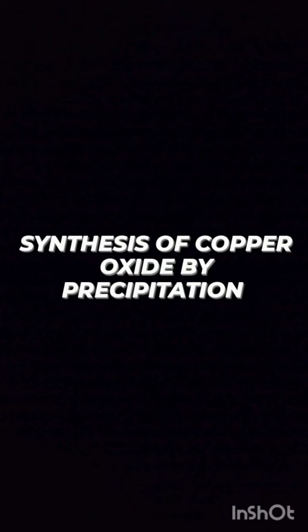Hello friends, our project name is synthesis of copper oxide by precipitation. Copper oxide can be synthesized by simple precipitation method in the lab.